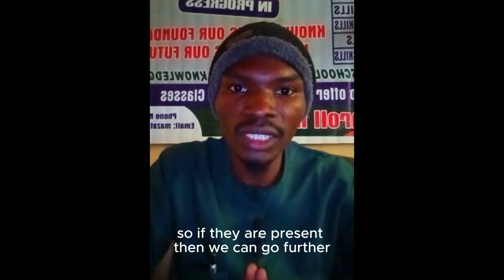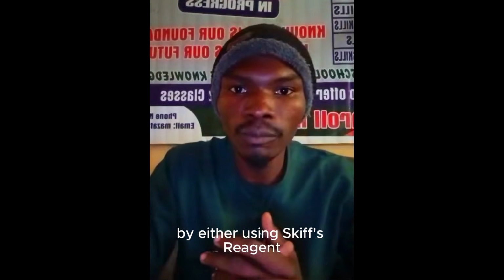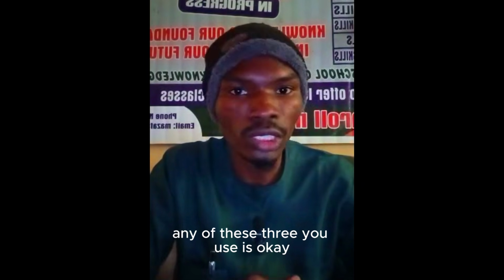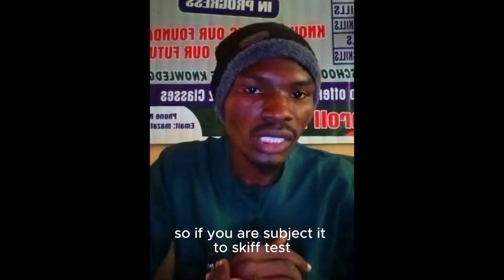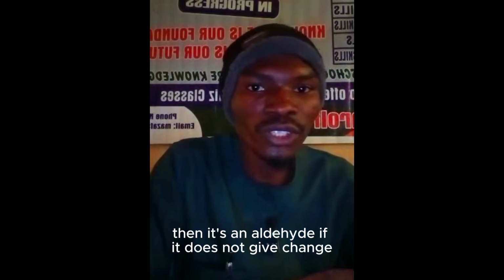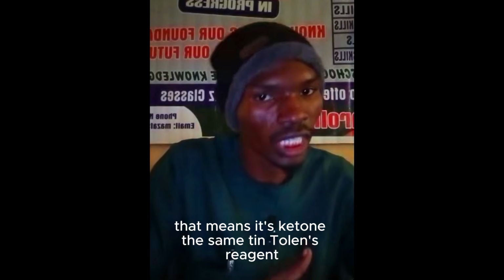If they are present, then we can go further to distinguish whether it's an aldehyde or a ketone by using either Schiff's reagent, Tollens' reagent, or Benedict's solution. Any of these three you use is okay. If you subject it to the Schiff test and it gives a positive test, that means a change in color, then it's an aldehyde. If there is no change in color, that means it's a ketone.